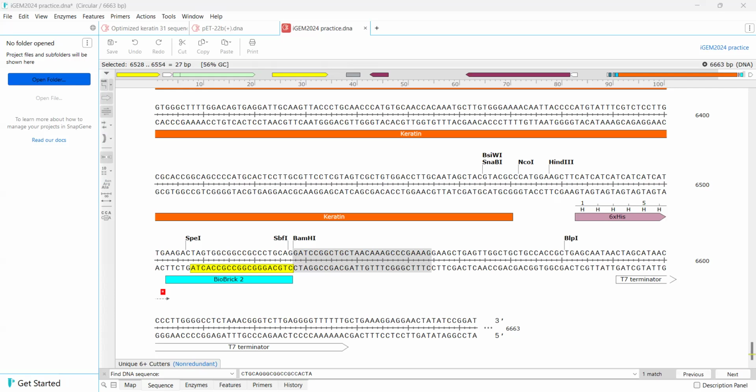Not the best. I forgot what we did. Let's see. I think we had like 24 because we just couldn't do anything. Or maybe here, no. If we did like here.